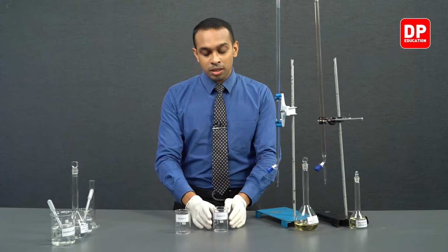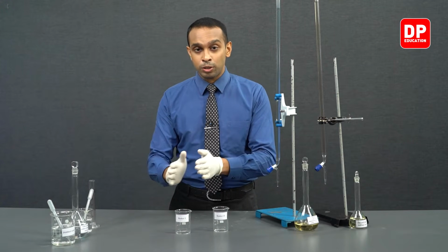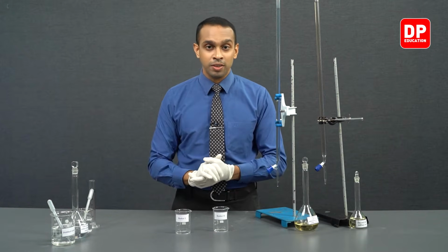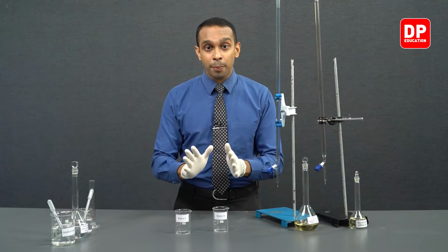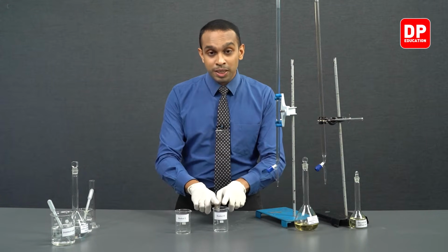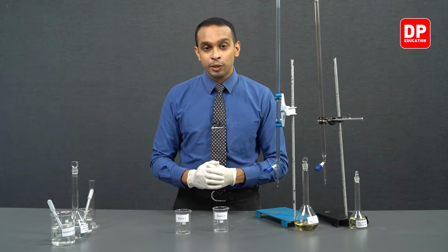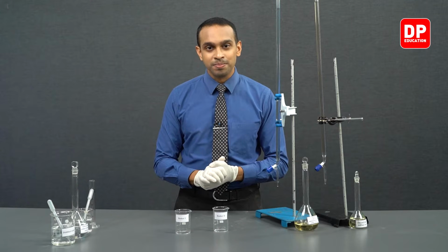When you do that, students, potassium iodide comes into contact with Fe3+, or iodide ions come into contact with Fe3+ ions in the medium, and the main reaction we are interested in will happen, and it will produce iodine. And this medium has starch. So iodine will react with starch, right? And will produce a blue-black color.